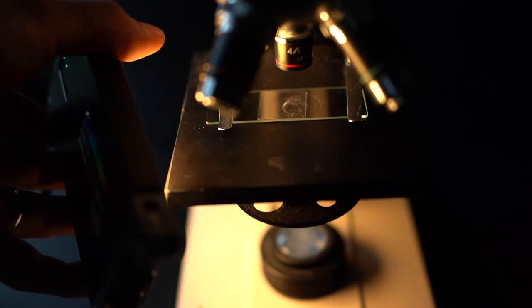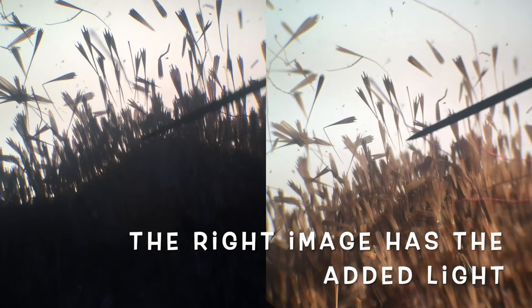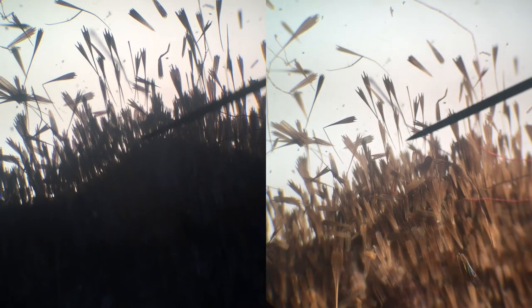And you can see a major difference between the two microscope images just by adding some top light onto your stage.